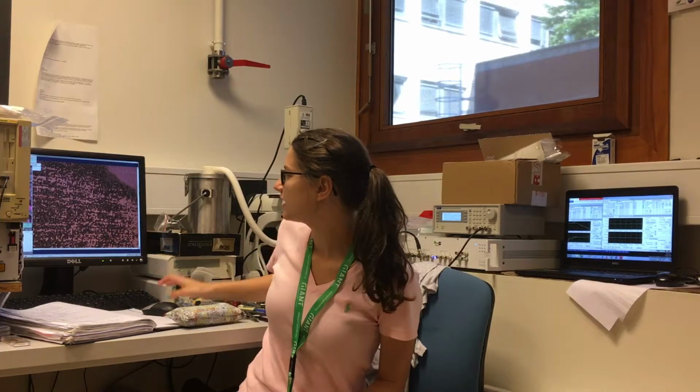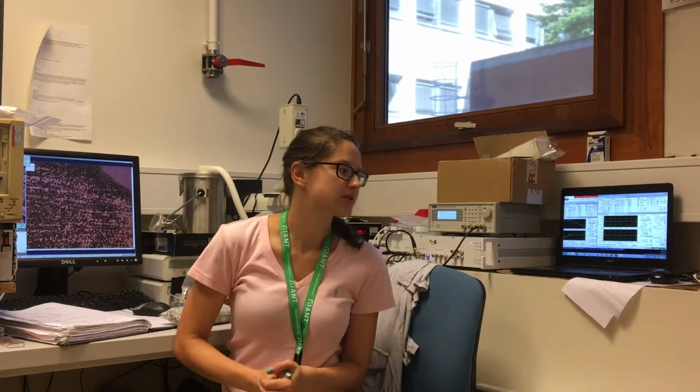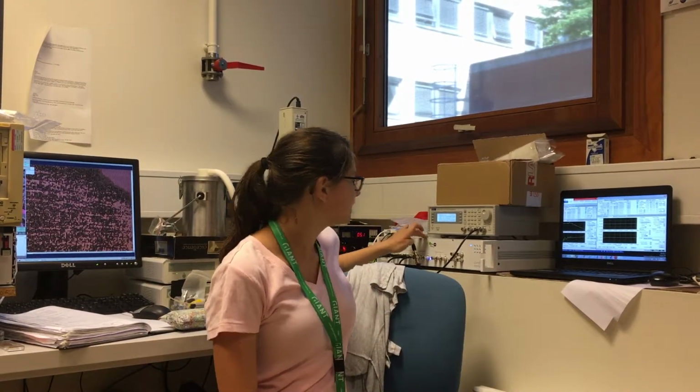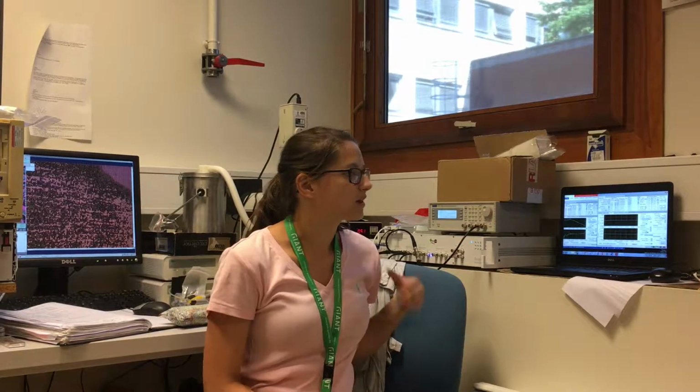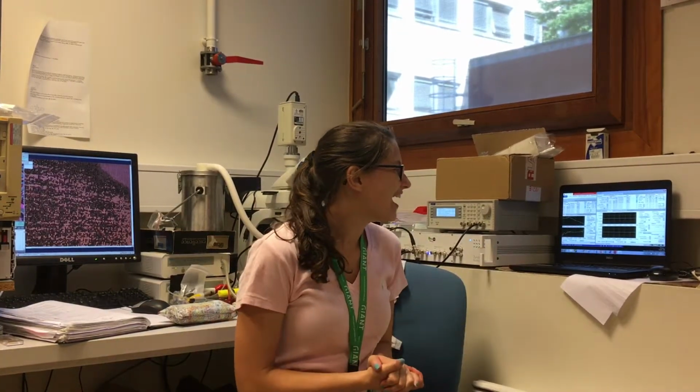So right now I have the cell at 33 degrees Celsius, and I'm going to keep the temperature constant while I go through a range of electric field strengths and use this machine to change the electric field strength, and then this machine to conduct dielectric spectroscopy measurements over here on this computer. And so now I'm going to take a measurement, and ultimately the goal is to embed nanoparticles in this material and see if we can use the electric field strengths to control the orientation of those nanoparticles.